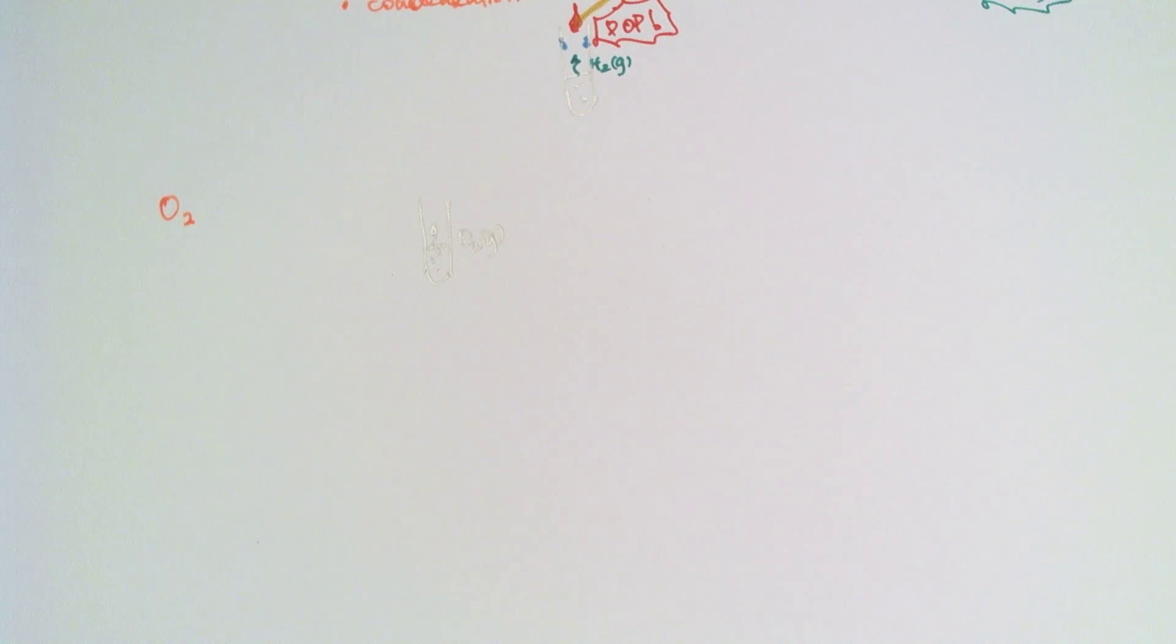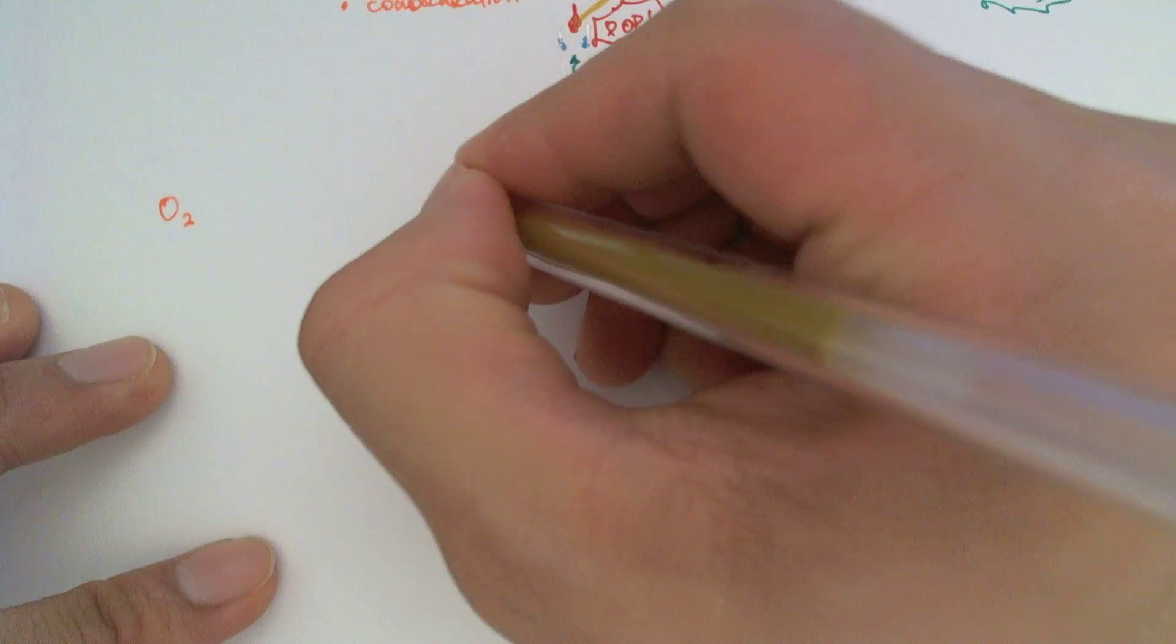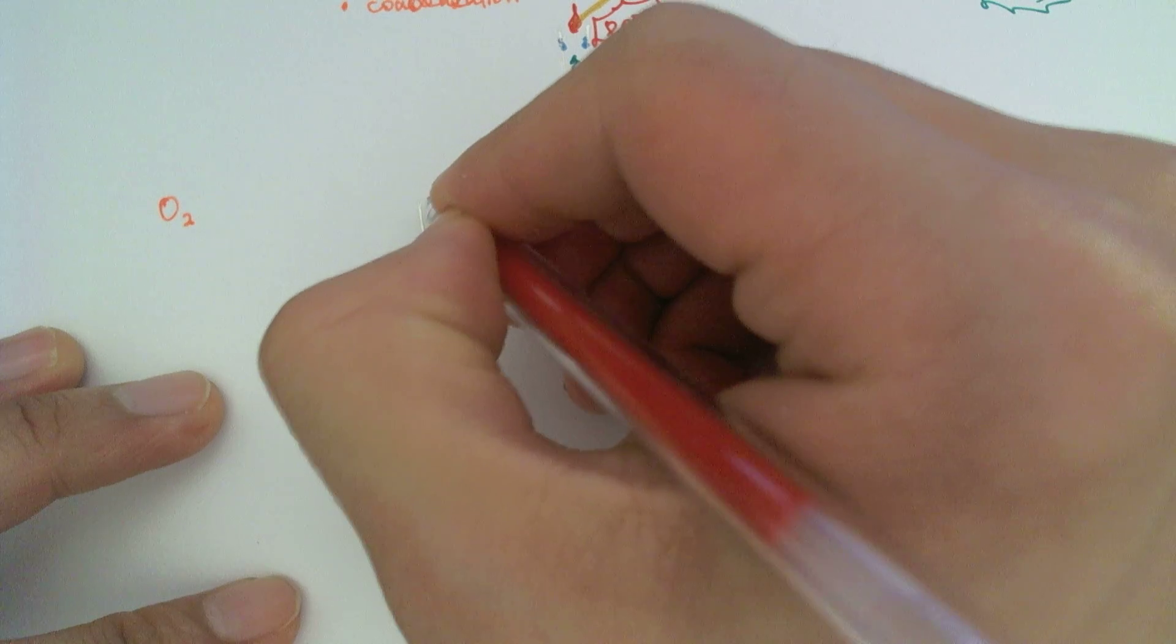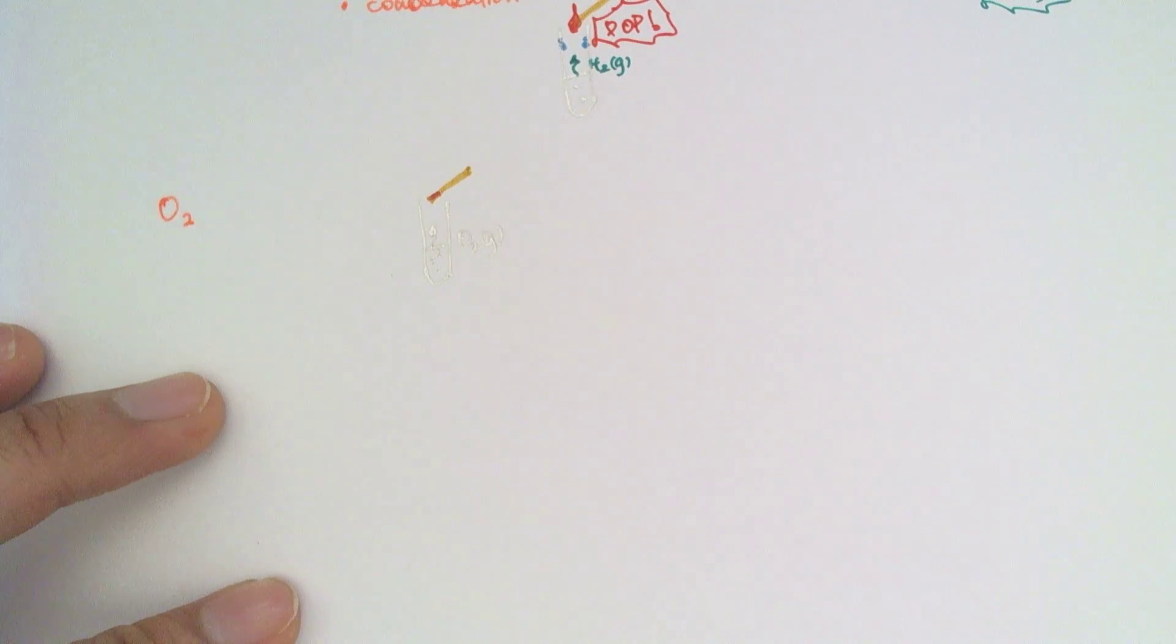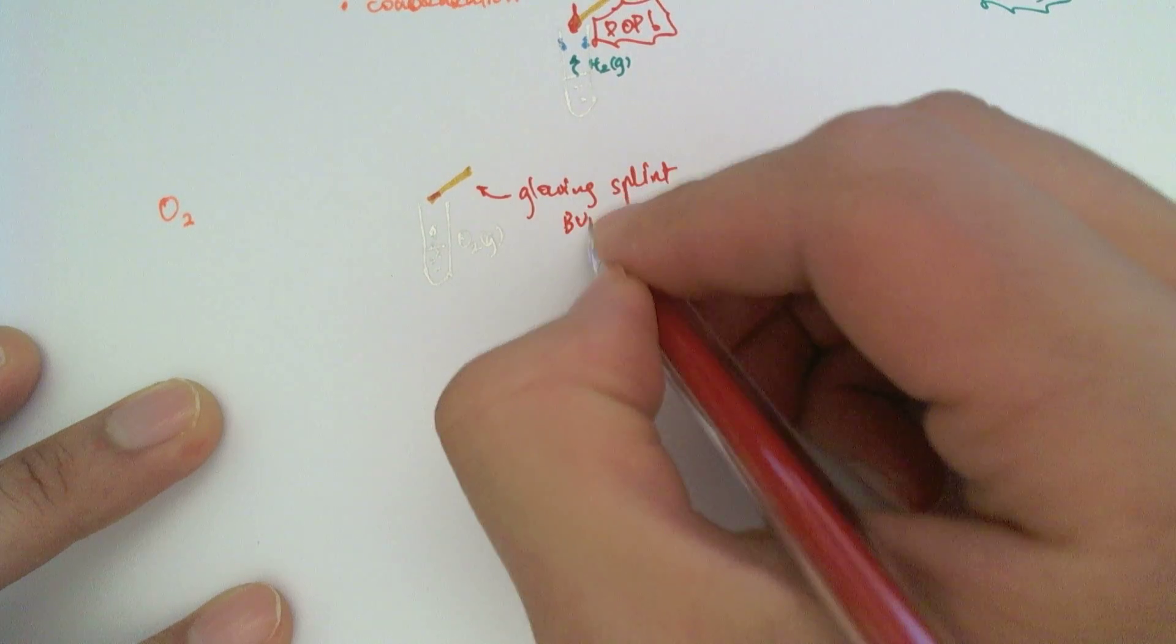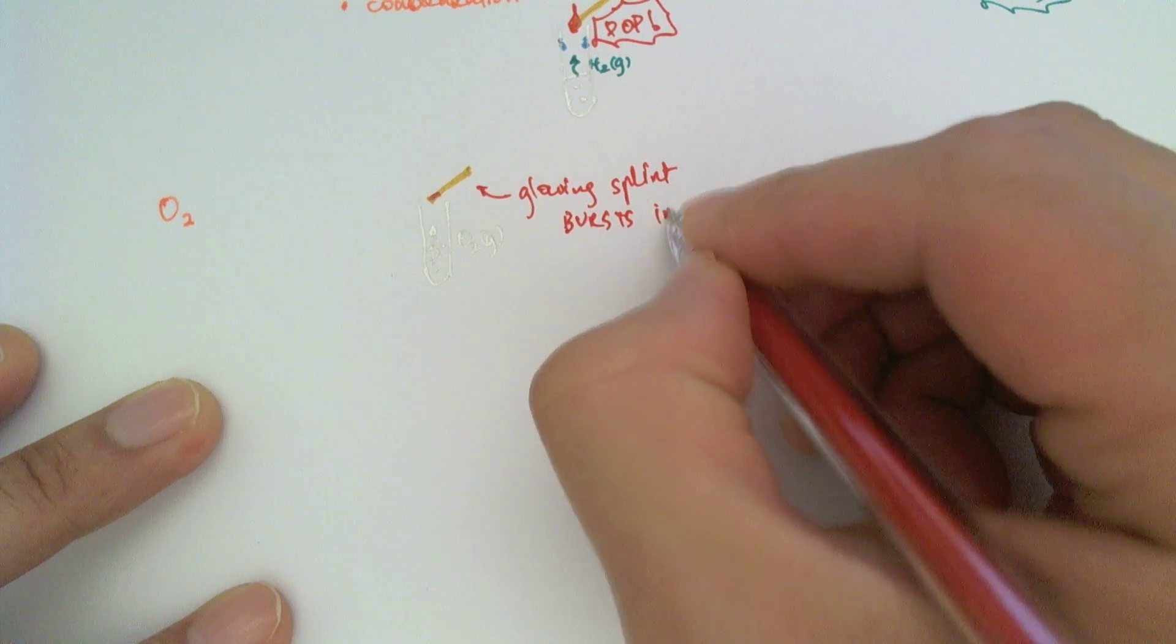What we'll do is you will take a splint, and this time you're going to take a glowing splint instead of a lighted splint. So you take a glowing splint here. It will burst into flames and that indicates the presence of oxygen.